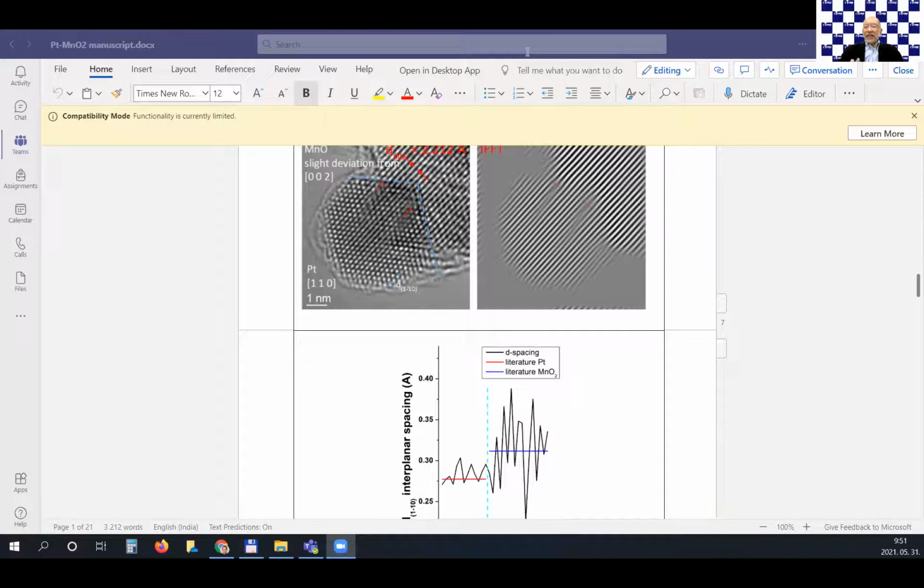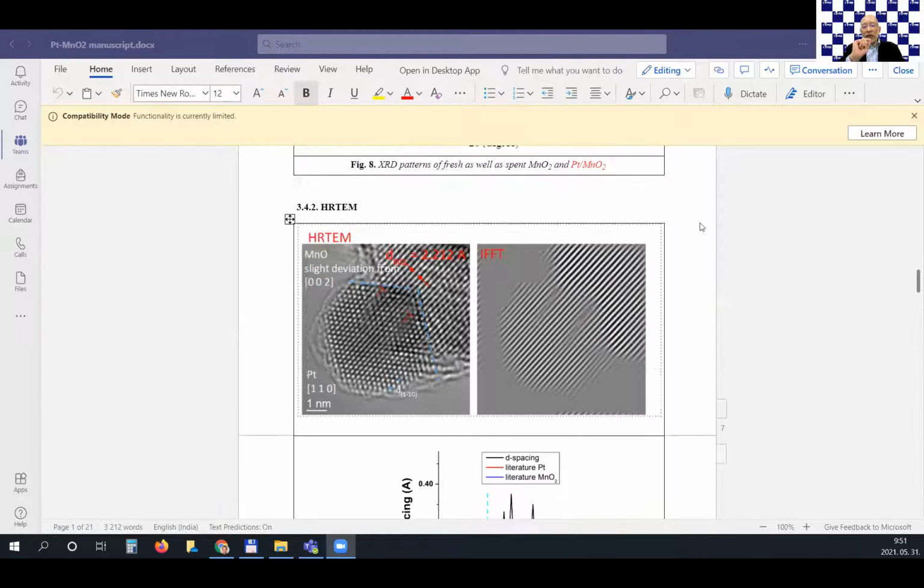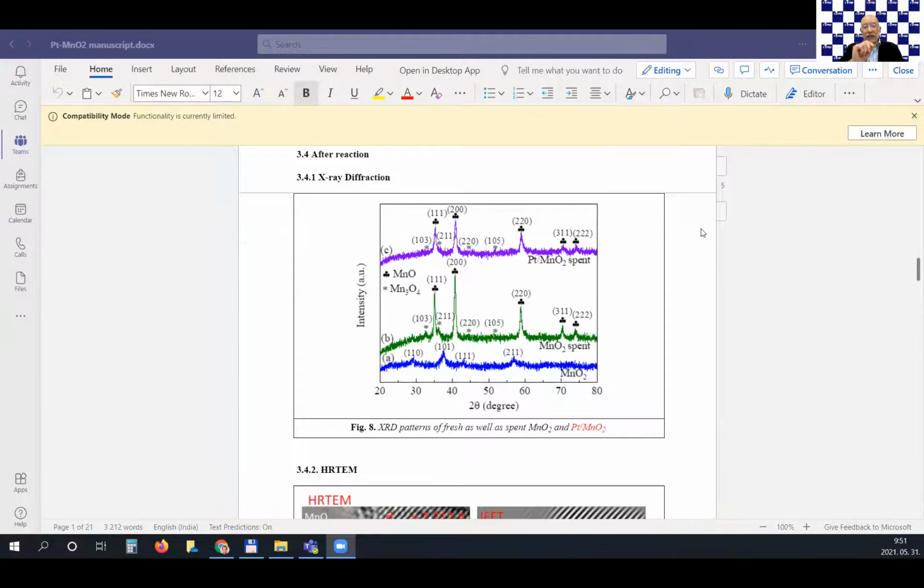Honestly speaking, there are two problems. The one is that we check the change of photoabsorption by filling up electron. If the manganese oxide has electron trap, the manganese oxide might be a black sample, dark colored. So therefore, before starting measurement, there is already some photoabsorption in the range of visible light.